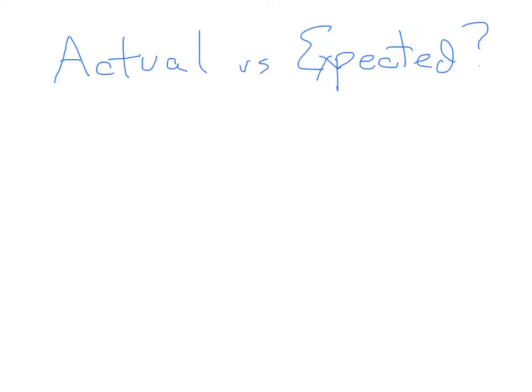So a takeaway of this lab activity of observing osmosis is that it's not all about the pressure sensors that we use, it's about the process of osmosis. Like every lab activity that we do in science with the scientific practices that we're applying, we want to look at the actual results that we got, but just as important, look at what would have been expected and analyze our experiments for any errors that might be made, but make sure we focus on the process.